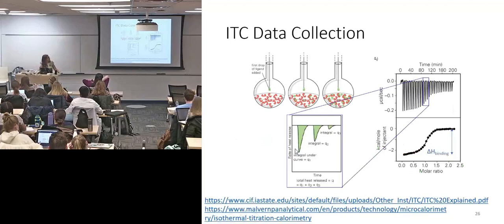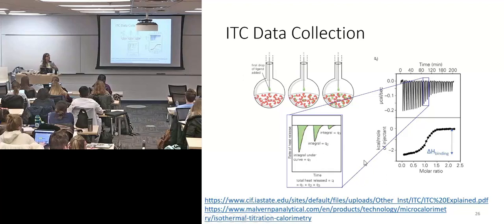And so this is rate of heat release, what we have over here. This is shown in microcalories per second, but this is what your data output would look like on an ITC curve. So these are different time points, and each of these spikes is, of course, for when you've dropped in more ligand. And you're getting these spikes for an exothermic reaction. This is the heat that I had to take out to maintain the temperature. And if you integrate under all of these curves and sum them up, you can get a total change in enthalpy for binding.